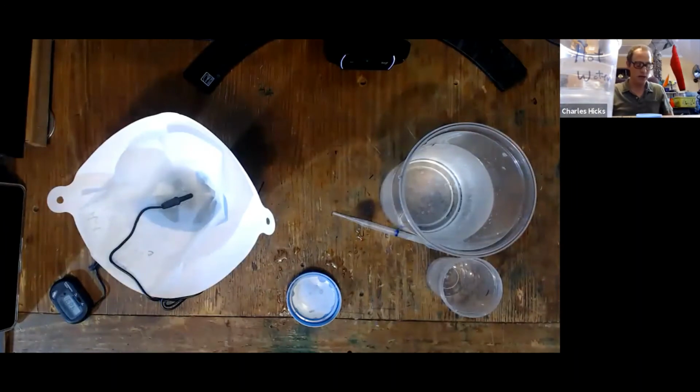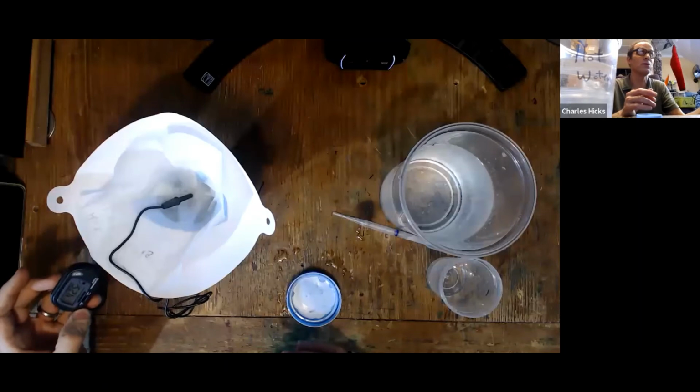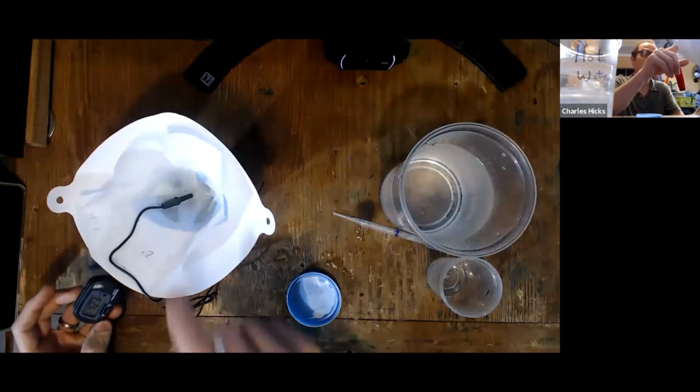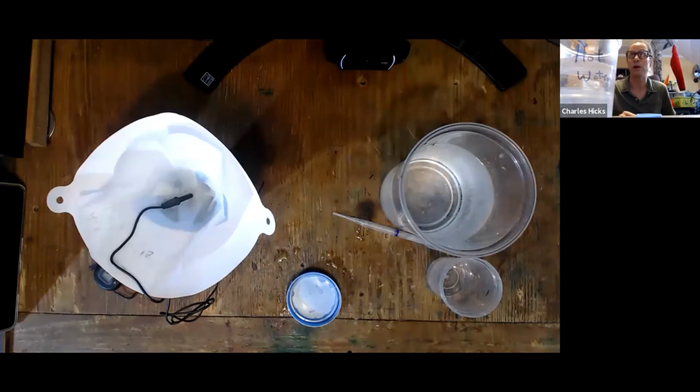As the solution drains, when the solution is about halfway through, you want to note the temperature. I saw that it was 43.5 a moment ago, right before the solution finished draining. That's what I'm going to record as the temperature for this trial.